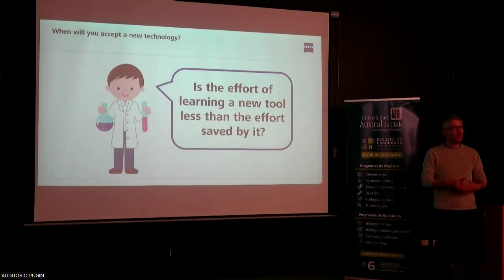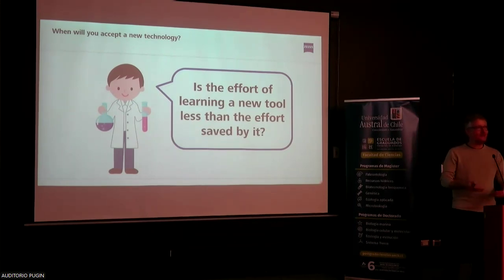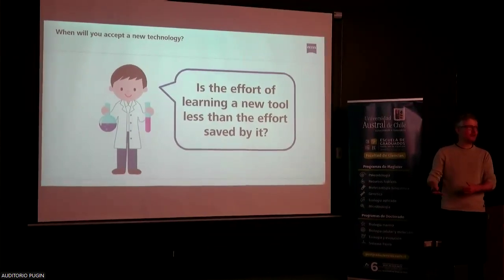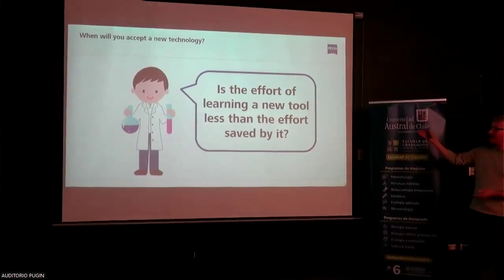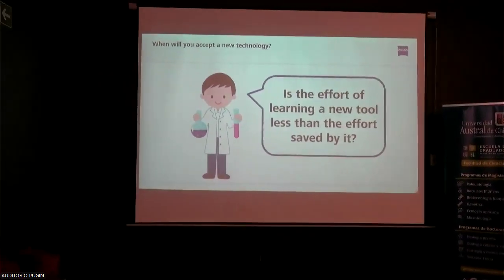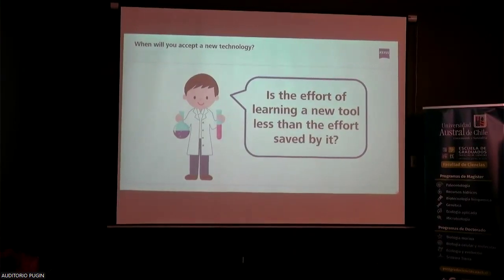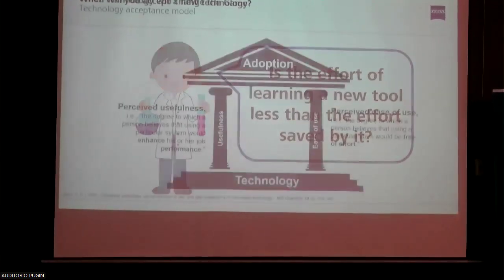And of course, the learning curve. How much time does it take to learn and adapt to a new technology? Yeah? So in the end, it needs to be a positive outcome. So you need to save time with the new technology. So basically, the effort of learning the new tool should be less than the effort that you save by this new technology.